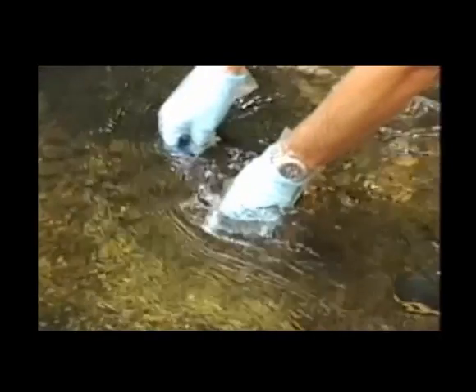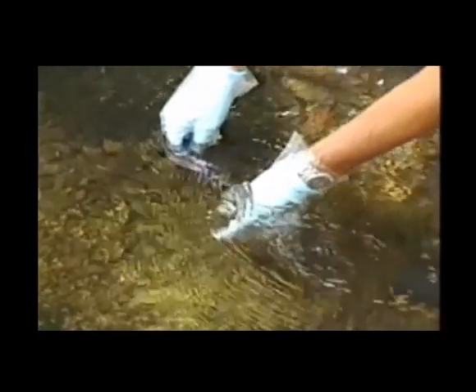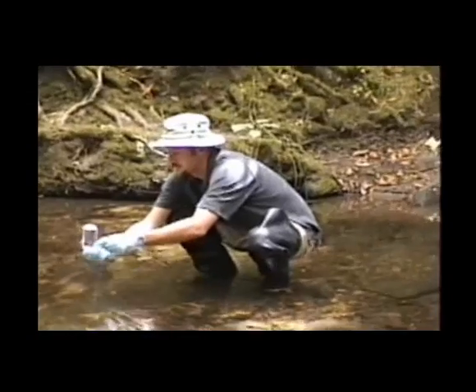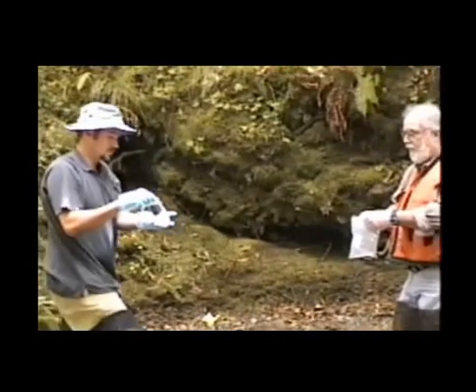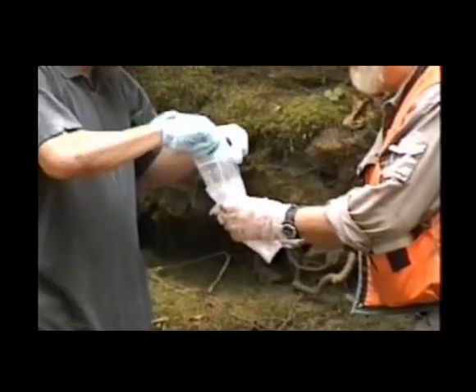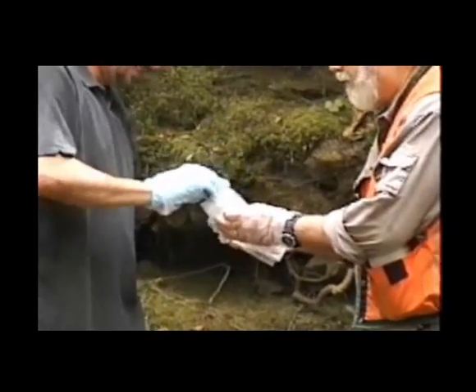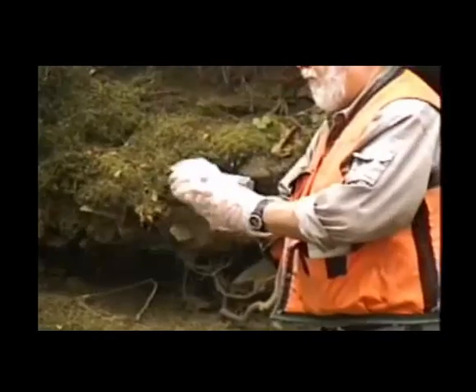And here you see a close-up of the sample. Again, the cap being held in the clean hands right hand, the sample in the clean hands left hand, capped underwater, checked for headspace. The sample is then returned to dirty hands, who opens up the outer bag, and then clean hands removes the clean inner bag, opens up the bag, and very carefully puts the sample container in the inner bag. The inner bag is closed, and then carefully pushed into the outer bag. Dirty hands then seals the outer bag, and the process is complete.